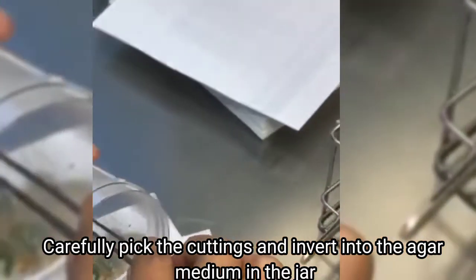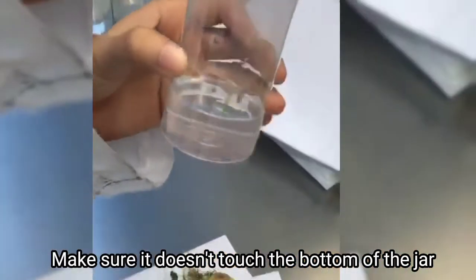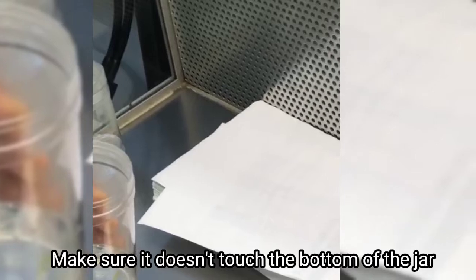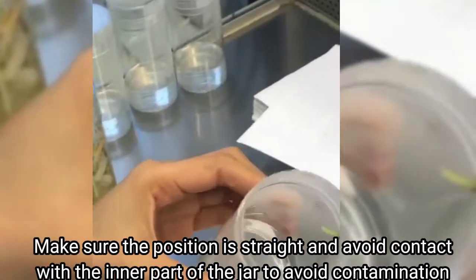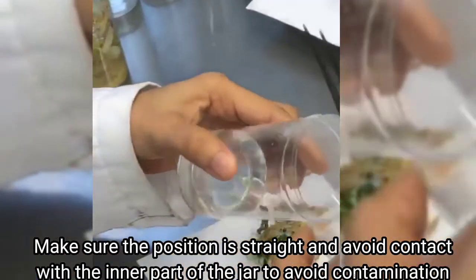Carefully pick the cuttings and insert them into the jars with agar medium. Make sure they are not reaching the bottom so the plant has space to develop its roots. Make sure the position is straight and your hands don't touch the jar to avoid contamination.